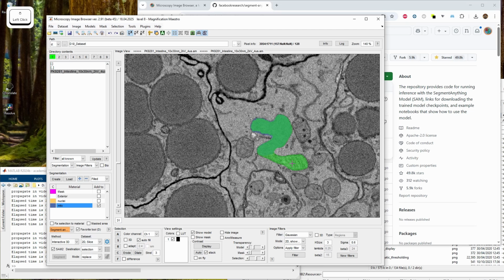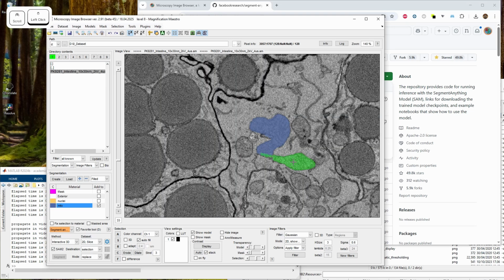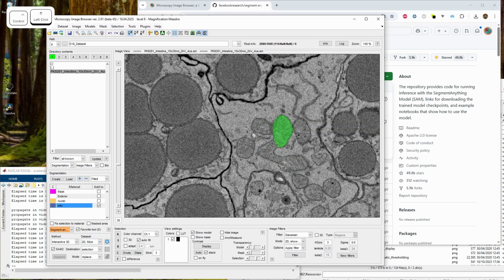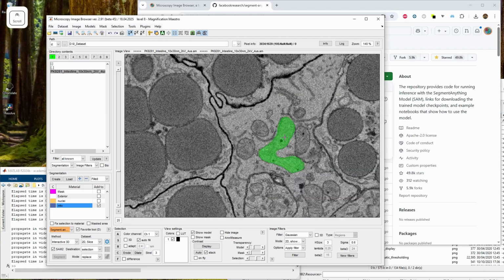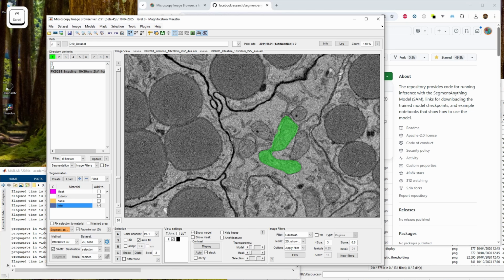Like you see now, I can get this one, and then when they actually separate, okay, there was a small fragment here, like now this shape is separated, so I can actually click here. Let's put Control click here, and then I scroll to where it goes, for example here, and then shift click. You see it can follow complex shapes quite nicely. If something needs to be cleared, I can still click on this if I really want to correct things on one single shape, and then hit A and then Shift A to add them all.